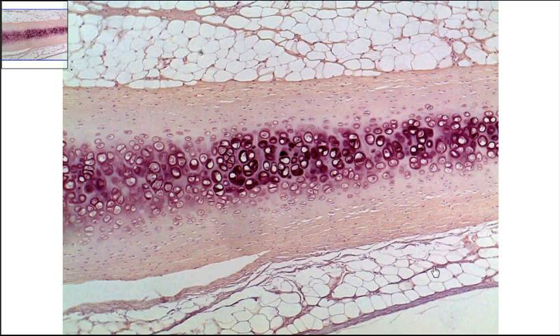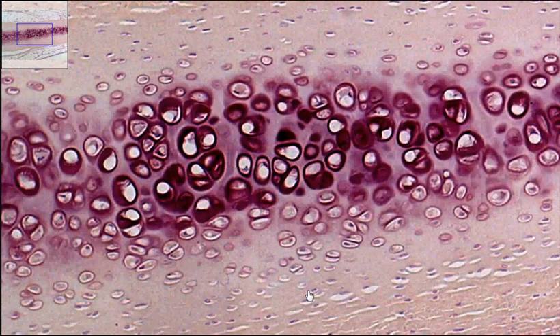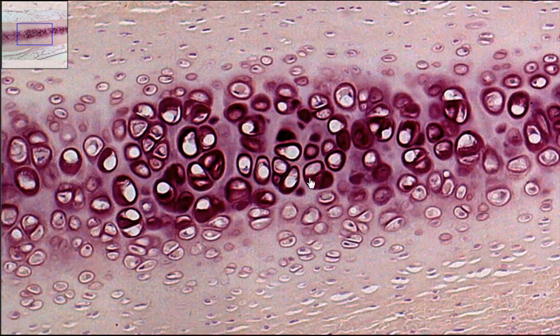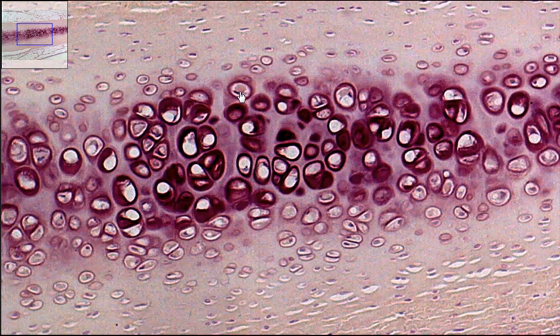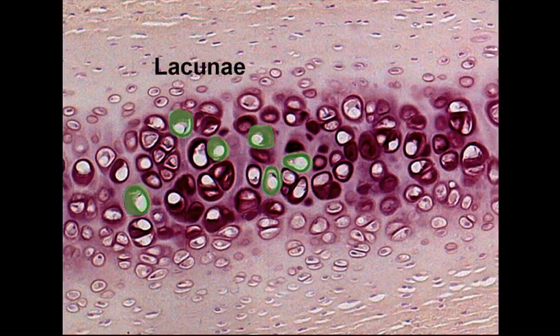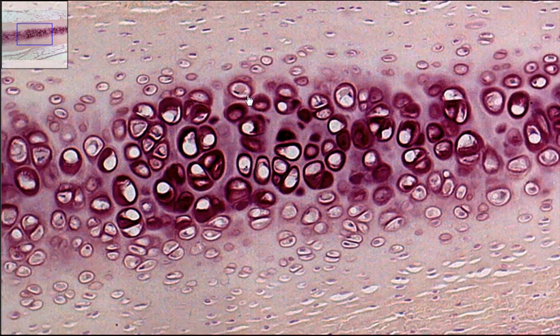What we're looking for is the features of this hyaline cartilage. If we zoom in, we can see these circular or oval-like structures, and some of them have little dots inside. This little circle inside is the actual cell — that is your chondrocyte. The chondrocyte is the mature cell that will maintain your hyaline cartilage. This outer shell around it is called lacuna, and the chondrocytes live inside lacuna.